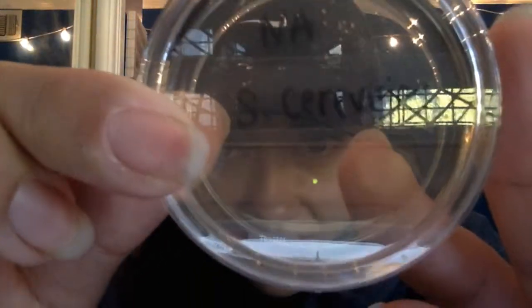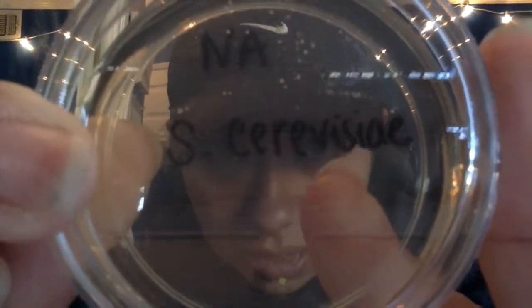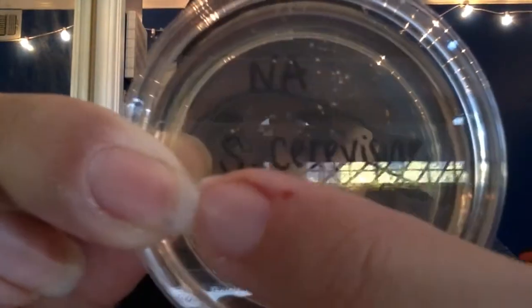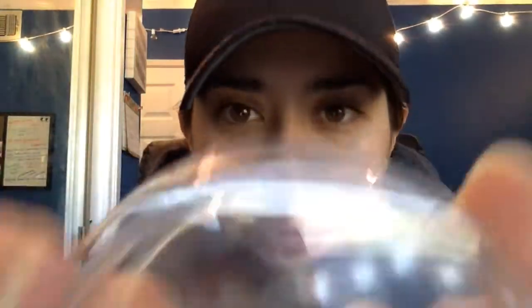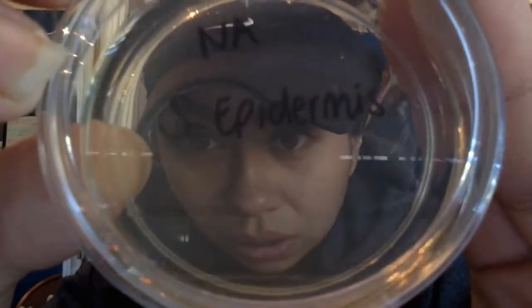We can see there's a little bit of growth in that top quadrant. But not so much anywhere else. I mean, I know the top quadrant was the one I started with, and then I went counterclockwise, but there's really nothing in the other areas. So there's that one. Again, here's the S. epidermis, and there's not much in any of the quadrants. There's no growth of any microorganisms.